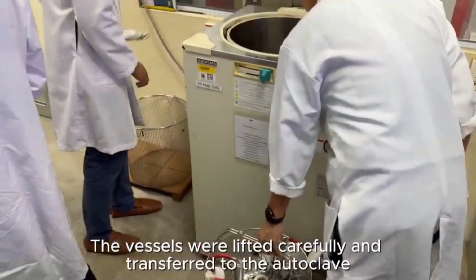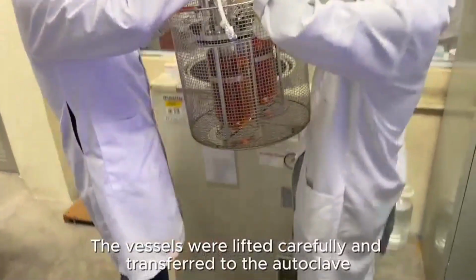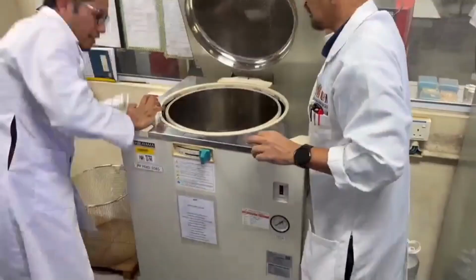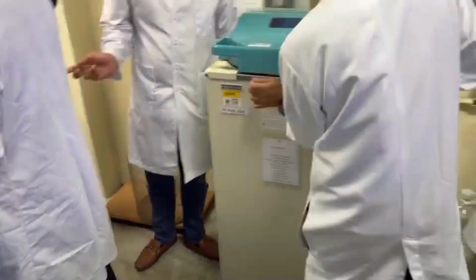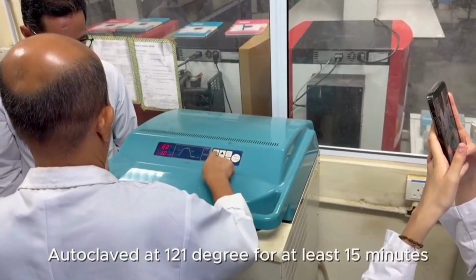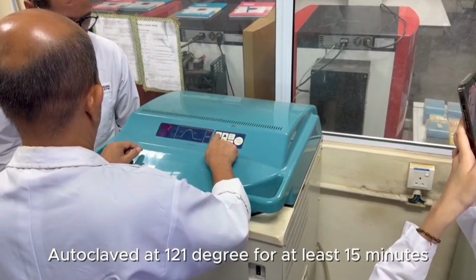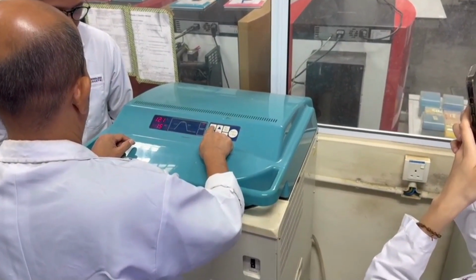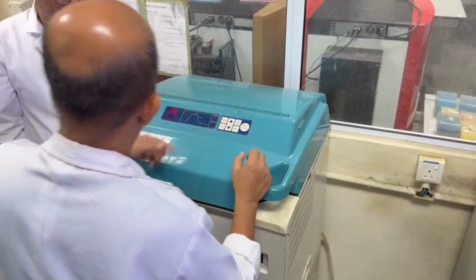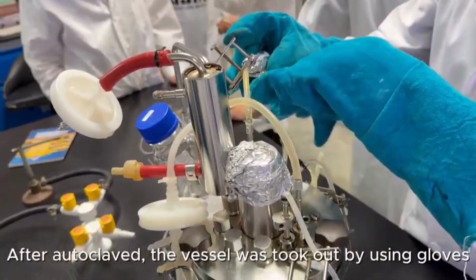The vessels were lifted carefully and transferred to the autoclave. Autoclaved at 121 degrees for at least 15 minutes. After autoclaving, the vessel was taken out using gloves.